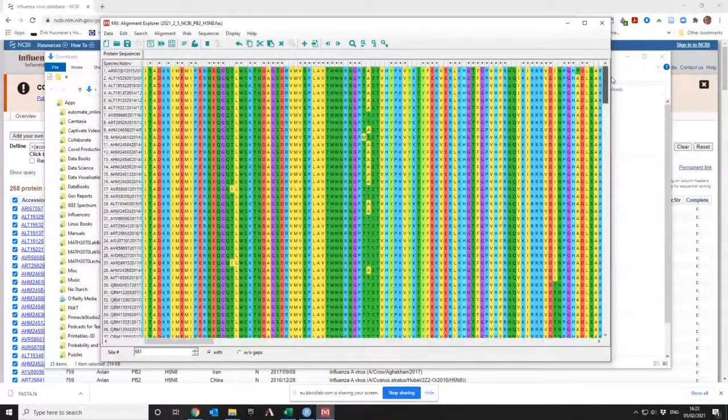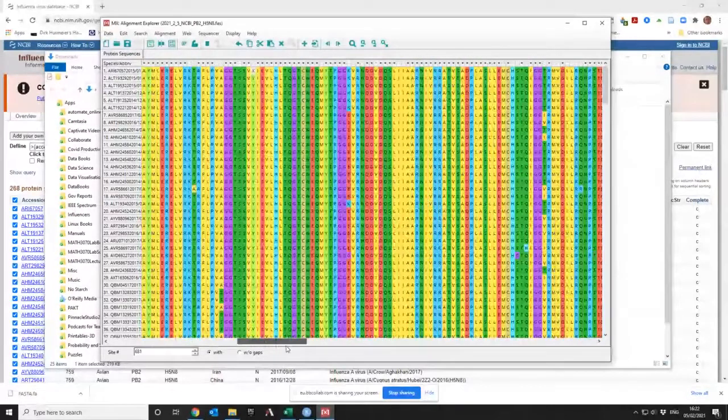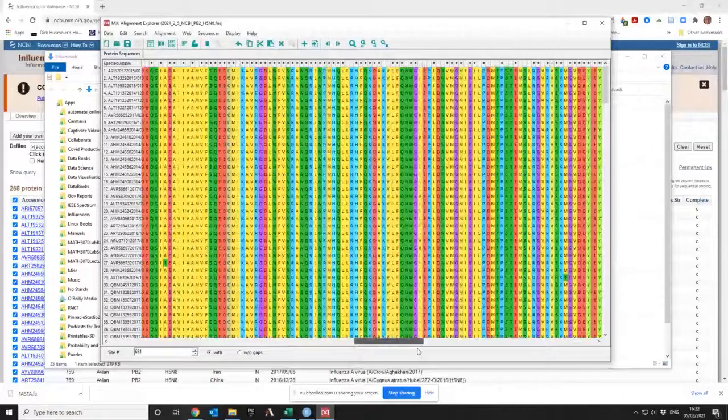But because there's only 3 changes there, this is a more recent mutation than the one that we had further across, which was those L and Q mutations, because they're roughly split, all the sequences half and half to be L and Q, whereas almost everything is H. So that means after L and Q separated from one another and kept evolving, the H arrived later, because it's less common.